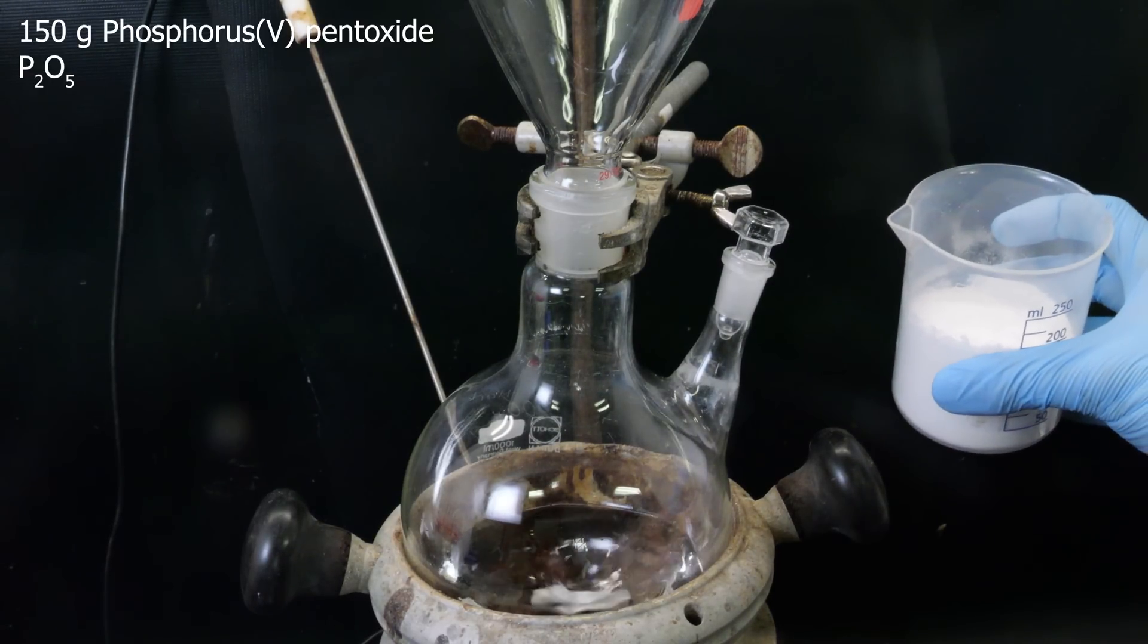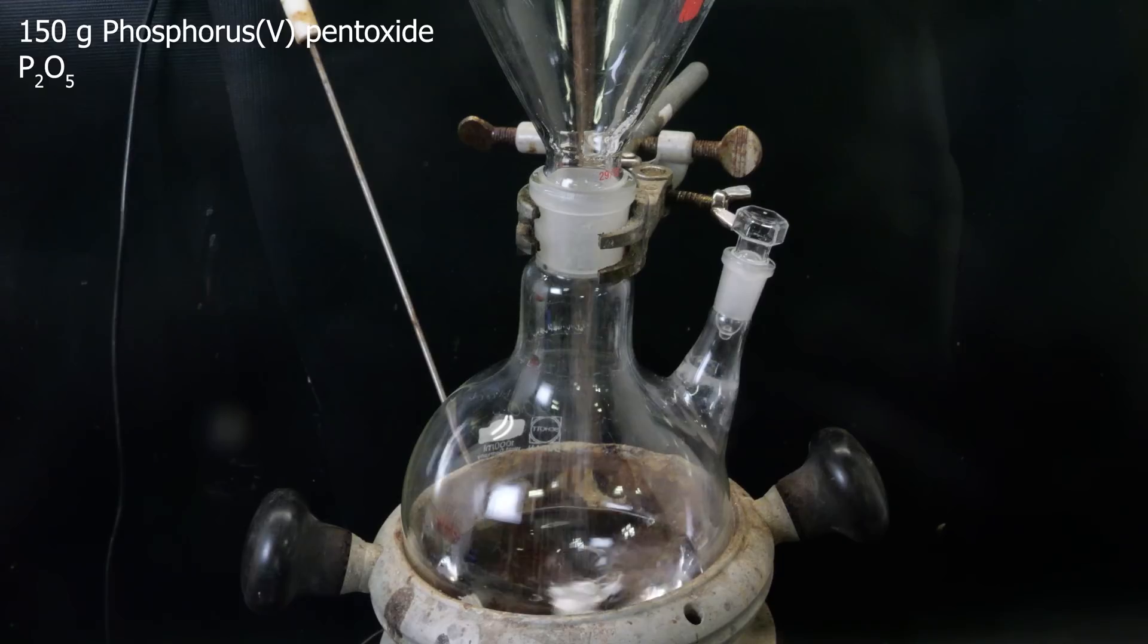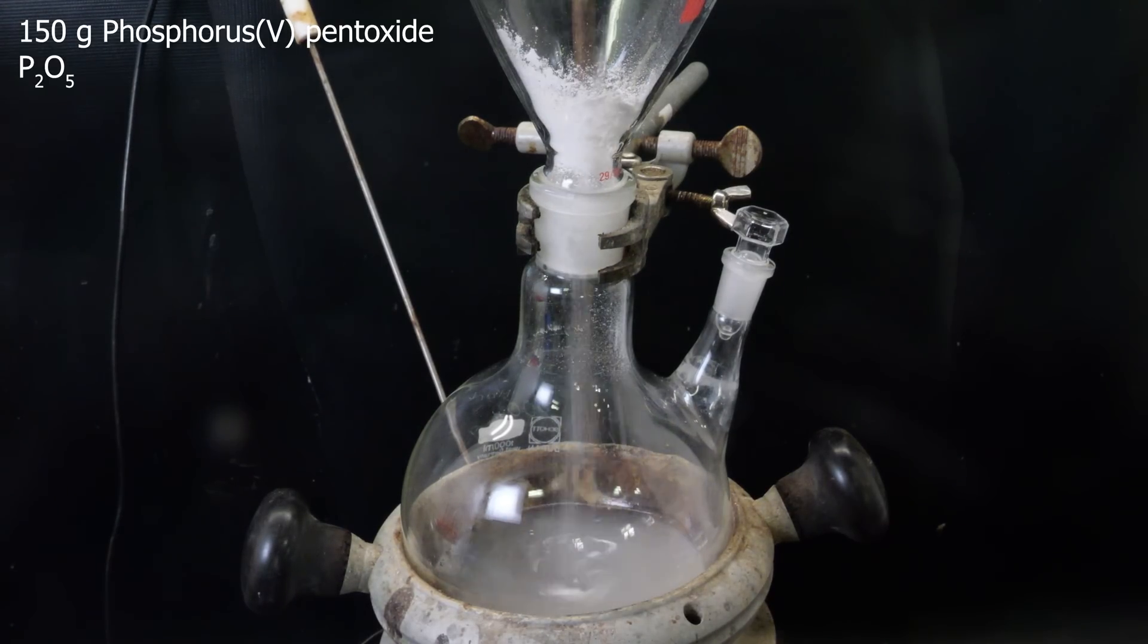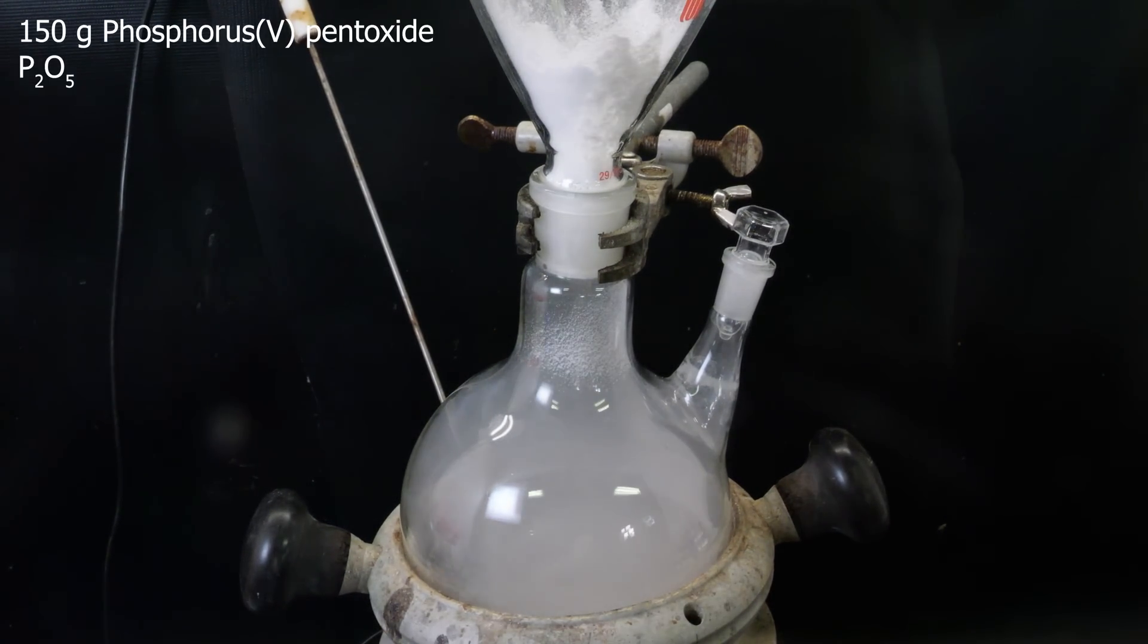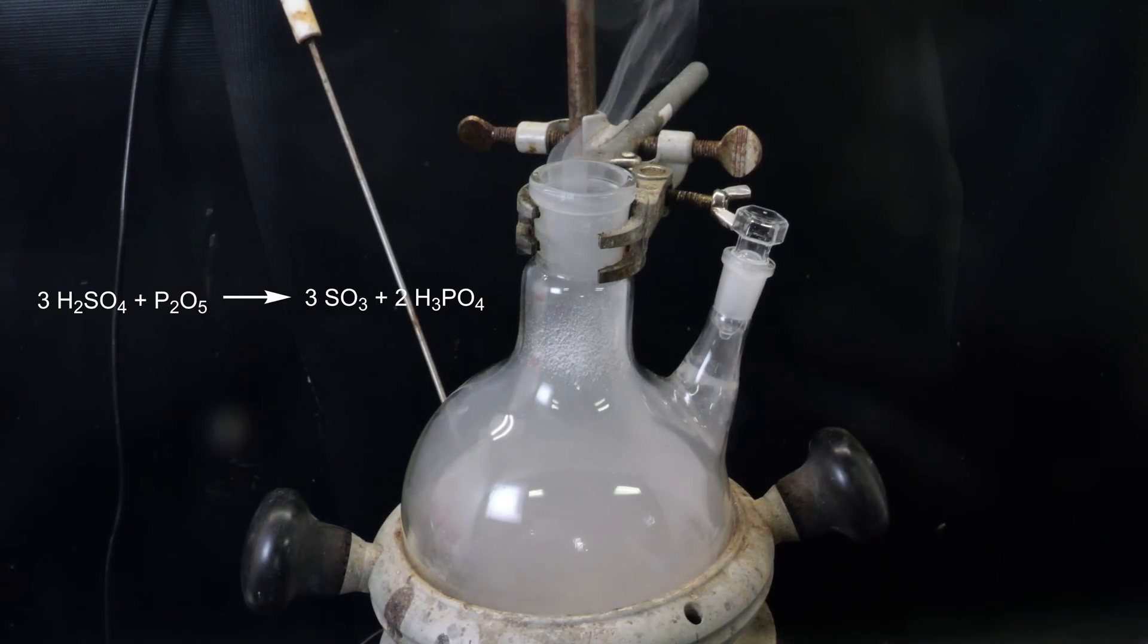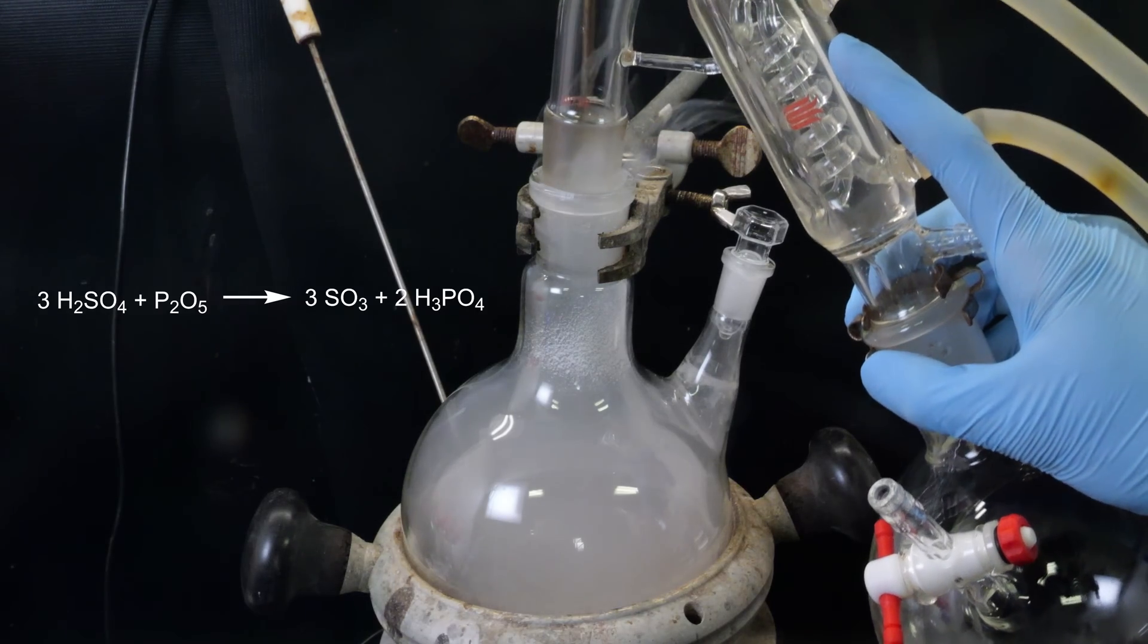While stirring, I gradually add 150 grams of the dehydrating agent phosphorus pentoxide, which is an excess. This should react pretty much instantly to form sulfur trioxide and phosphoric acid.